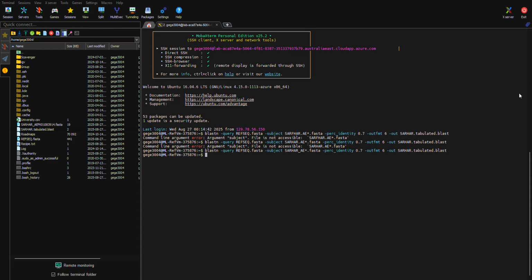So what we are interested in when you have the columns is the one with the match score. Okay? So there is no header line, but these are what they are. And we are interested in the one at the very end, the match score, which I believe is column 12. Can somebody confirm that for me? Okay? So you can adjust the parameters to get different ones at different scores. And we set it at 0.7.